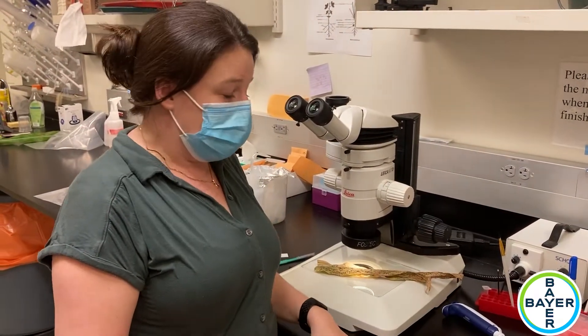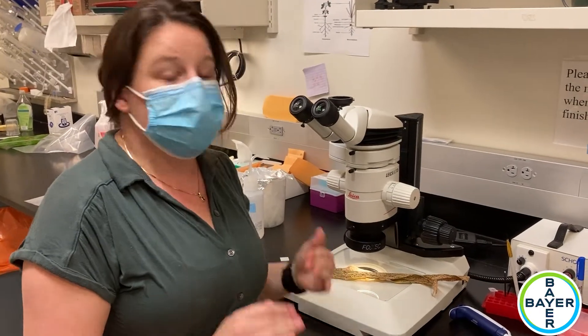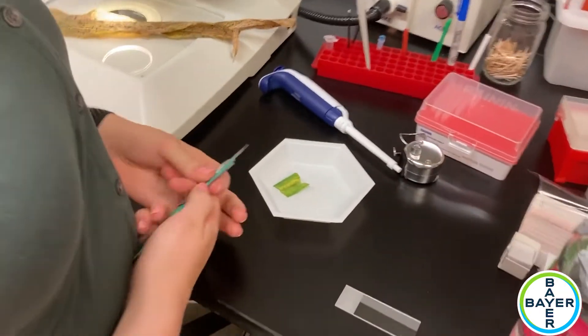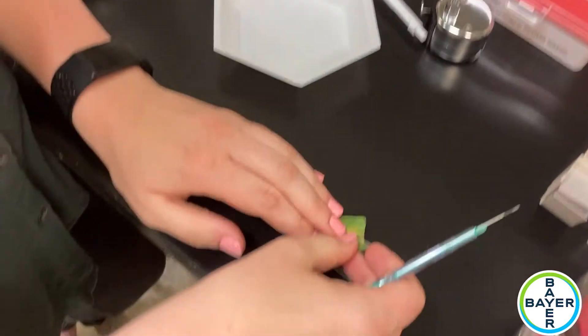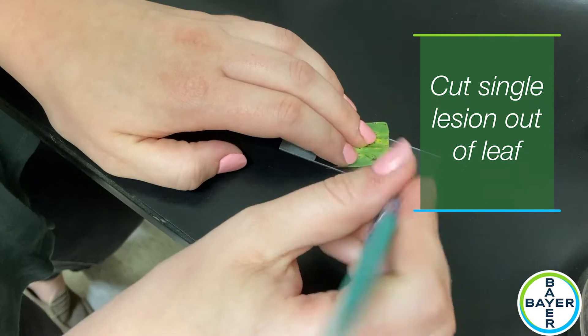When we're not quite sure if it is tar spot, the only way to have a definitive check is to look inside. I'm going to cut up one of these samples and basically just try to get a single lesion onto a microscope slide.